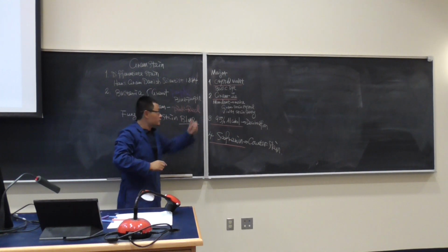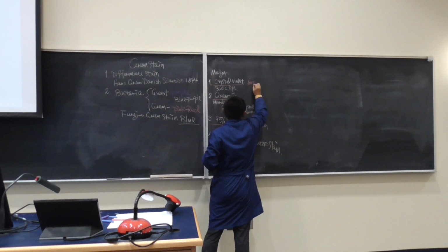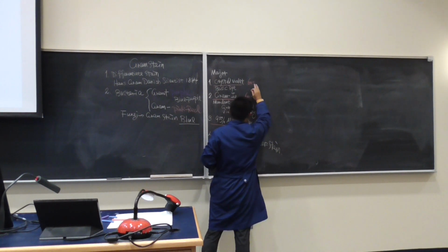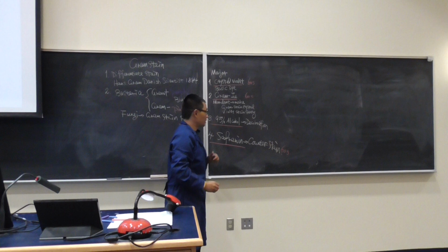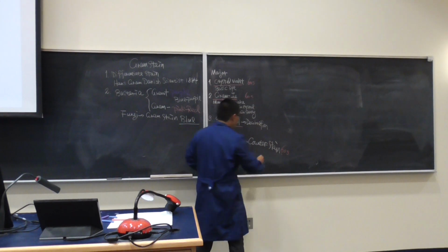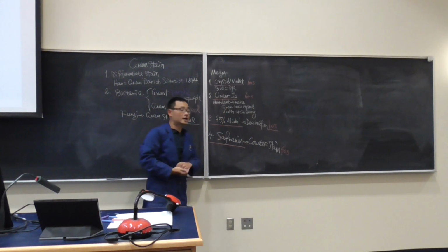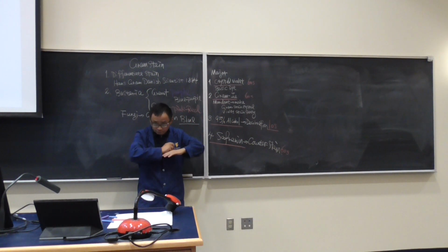And every single step basically is 60 seconds rinse, except for this 95% alcohol, which is only 10 seconds. Because otherwise, the 95% alcohol is going to remove everything.